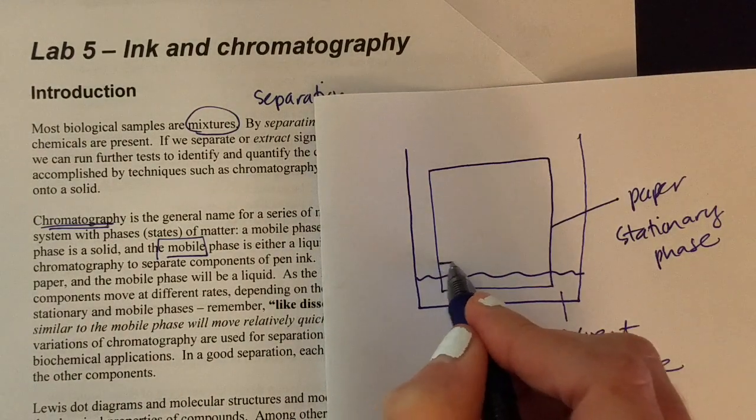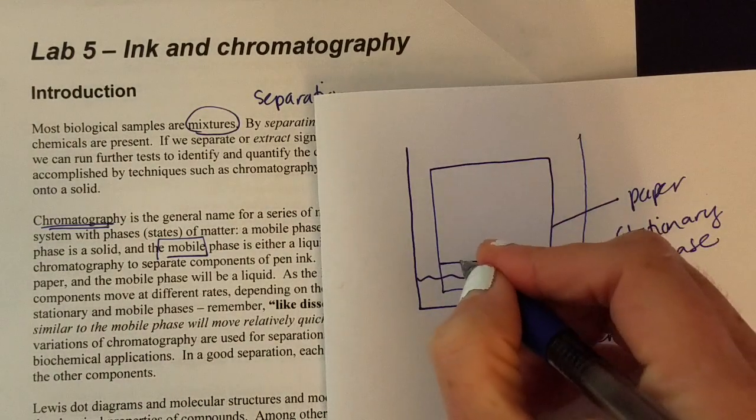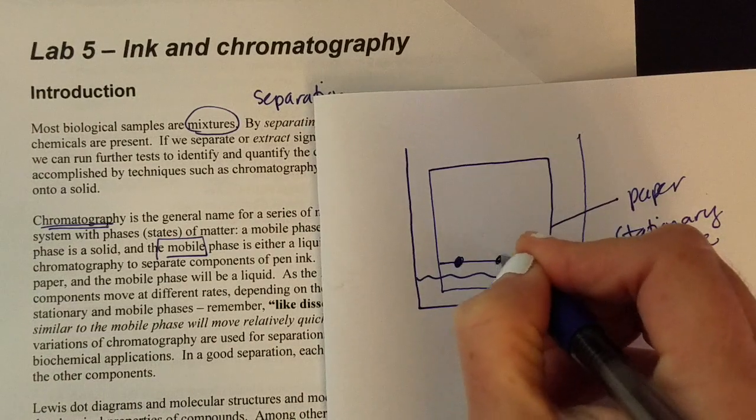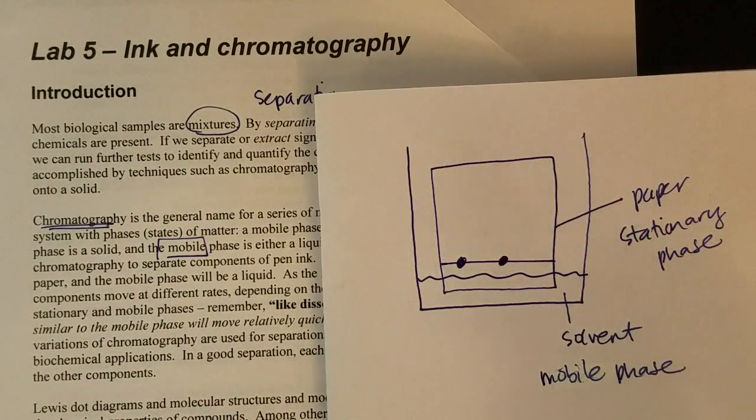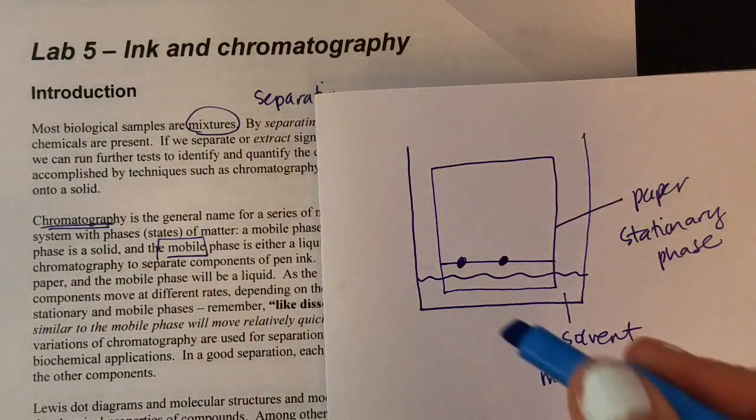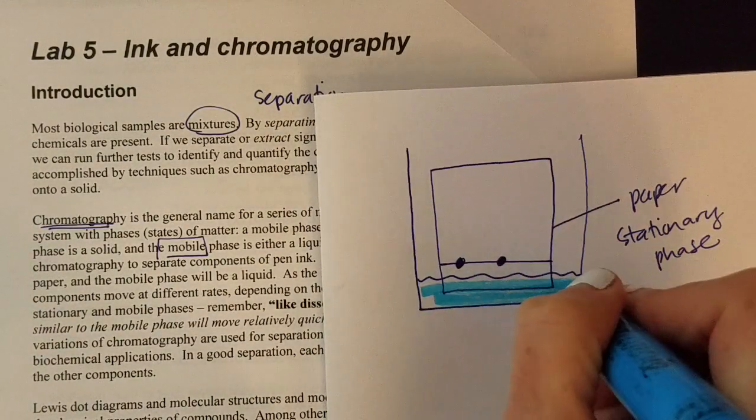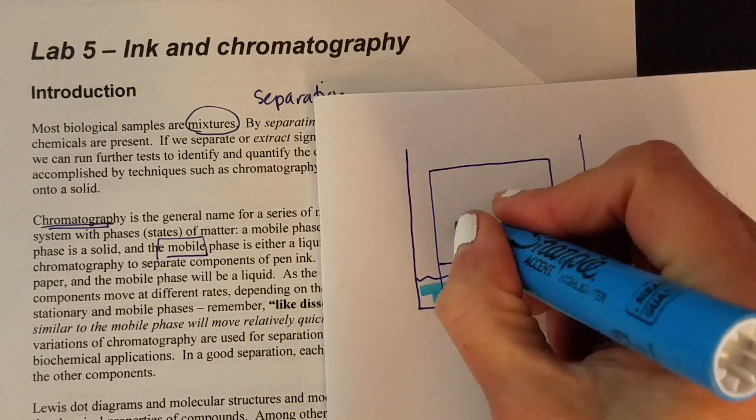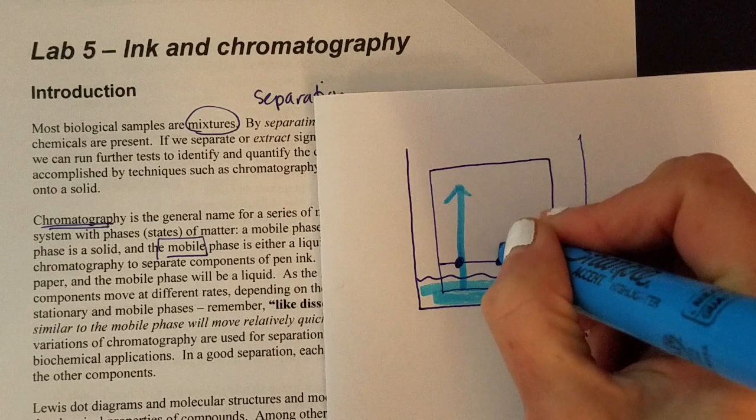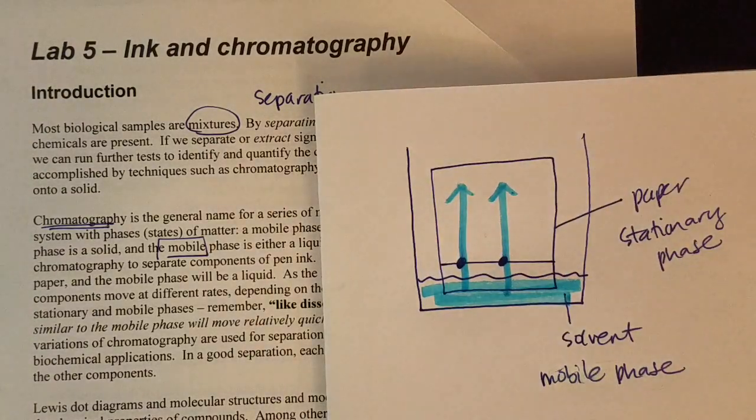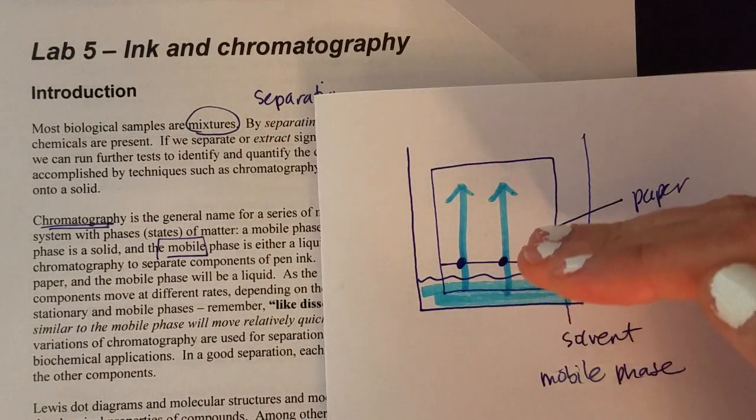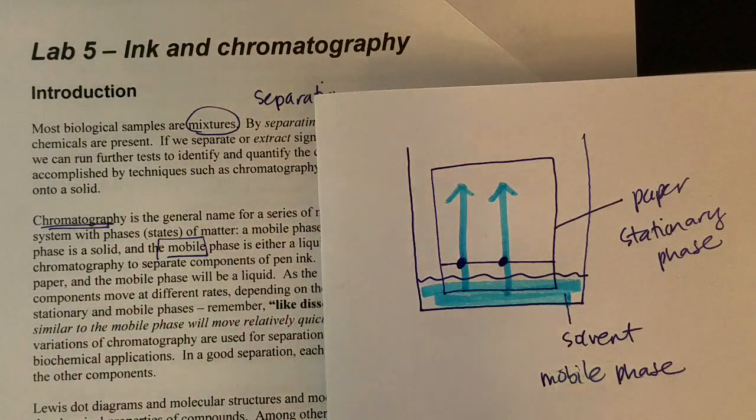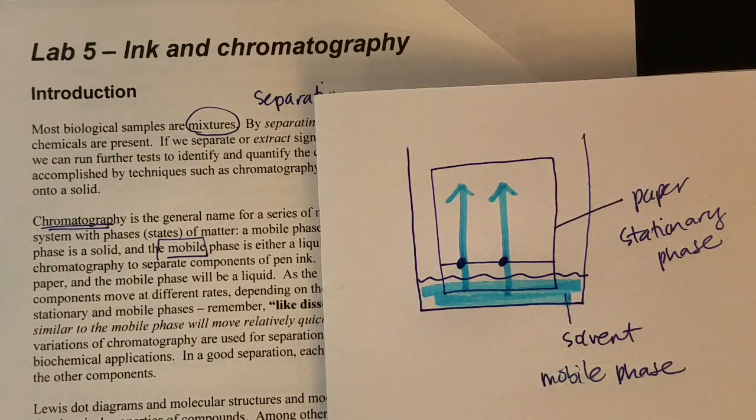So on that paper then we're going to put the substances that we want to separate. We're going to put a couple of spots of ink and over time, just like a paper towel or a napkin would at home, that solvent is going to get soaked up the paper. And so we will watch that paper progressively get wet. As that solvent moves up, it's going to start to separate out these inks.